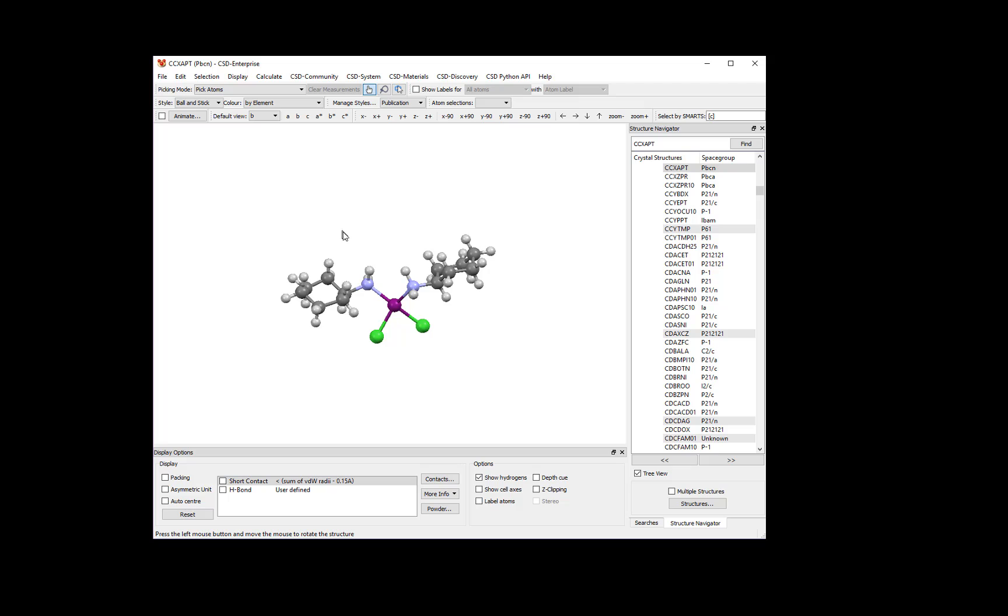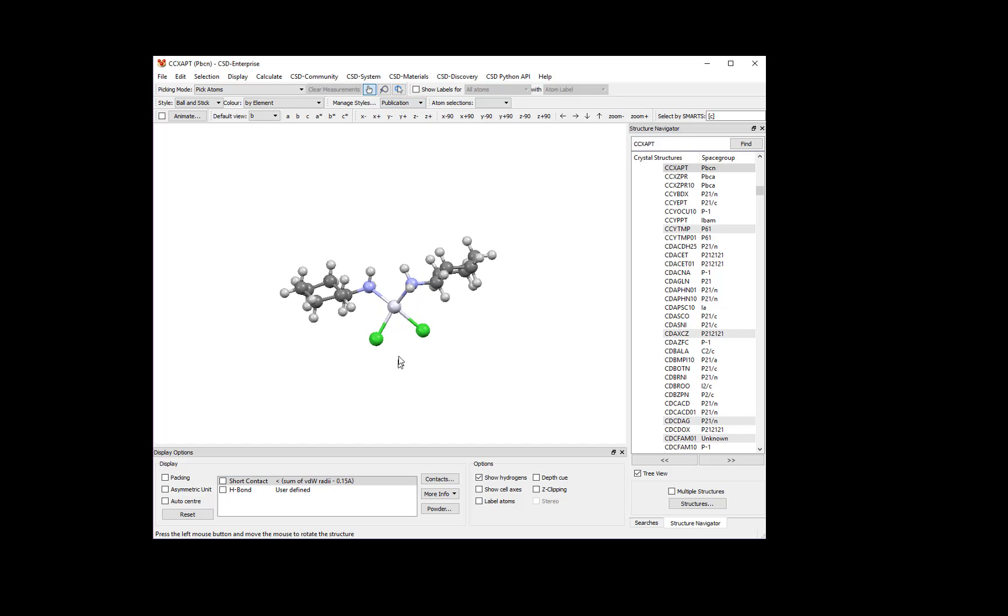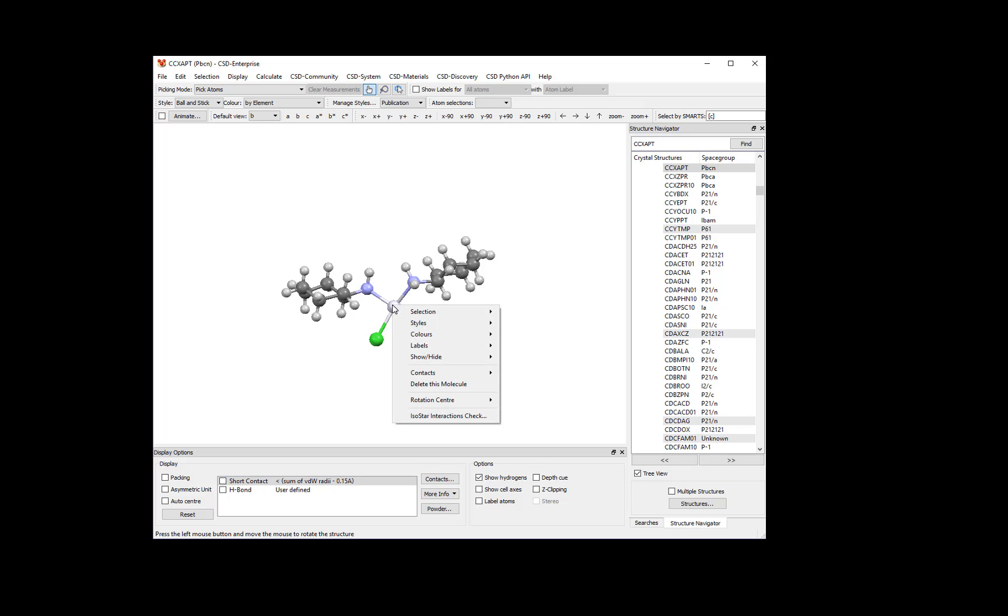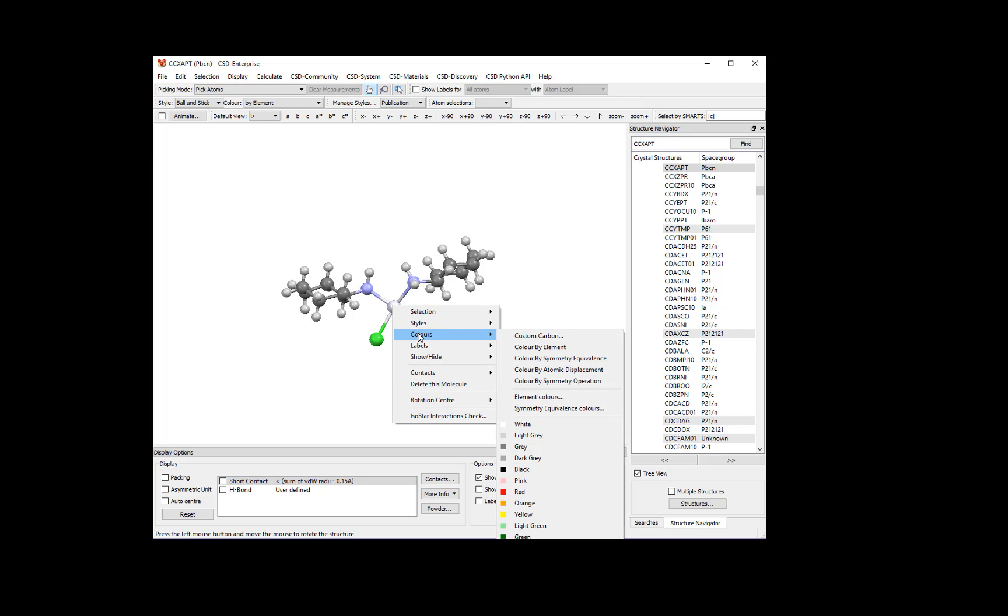To return to the default Publication view, simply select Publications from the Manage Styles drop-down menu. We'll return to a purple Platinum atom by right-clicking on the Platinum atom, choosing Colors, and then Purple.